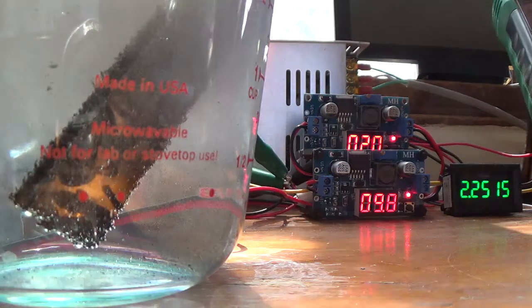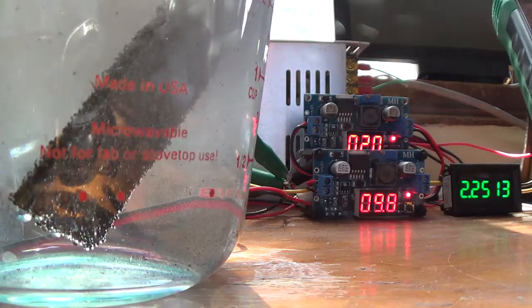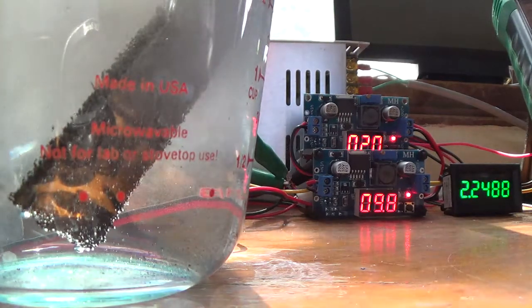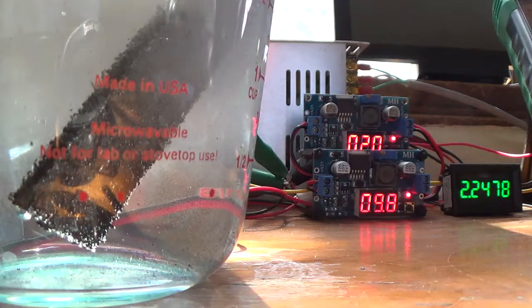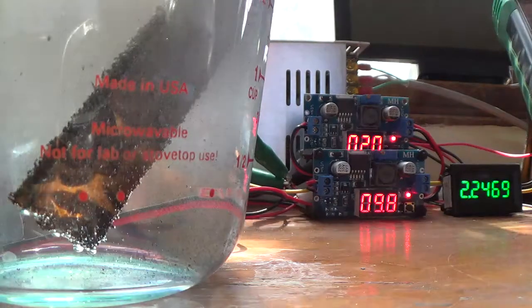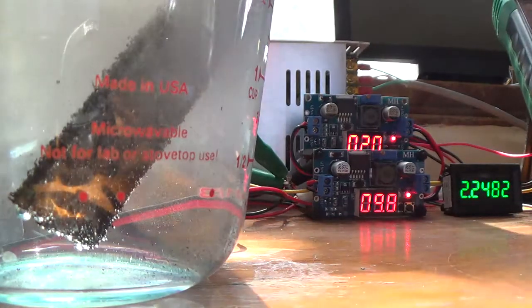And that is the sound of my meter getting ready to turn off. At this point in time, in the previous video, fully half of the graphite had been eroded away. And I would say at this point in time, we're less than 25% in. Still pulling about 2.25 amps. The raft is covering approximately 70%, and my meter has just turned off.